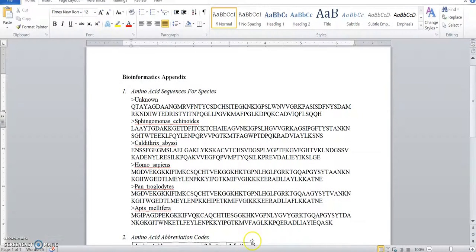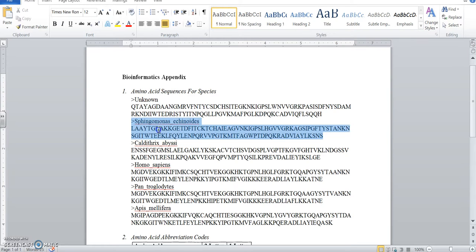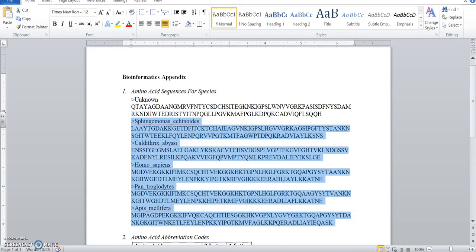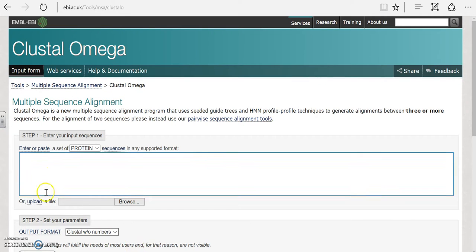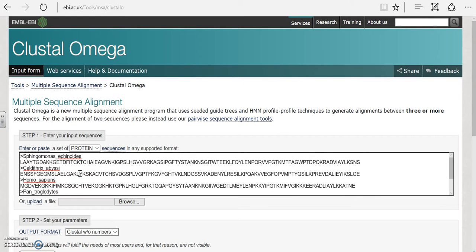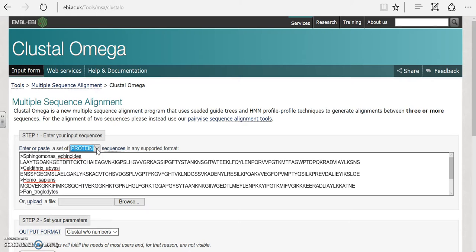Let's go ahead and pull up our appendix and we'll take the five species that we're comparing. Go ahead and highlight them and copy them. You can do that with Ctrl+C. Go back to your website, click in the box and paste them. You can do that with Ctrl+V. So you have your five species in there and make sure you are on the protein setting because remember we're comparing amino acids for proteins.